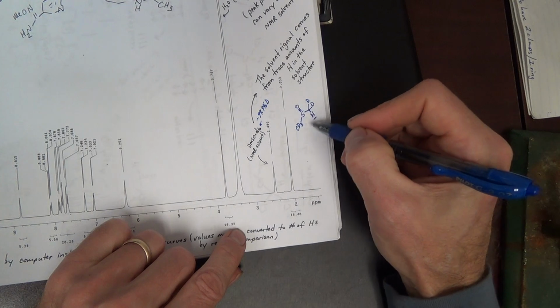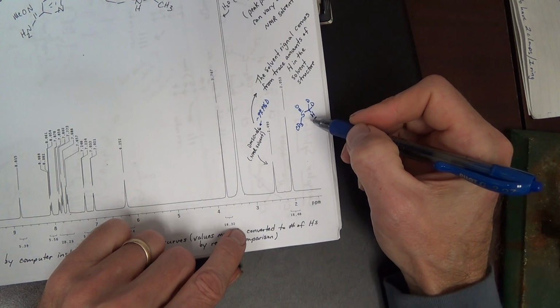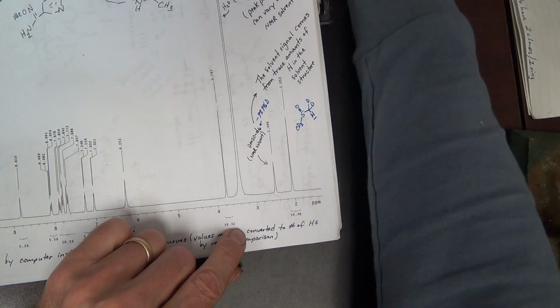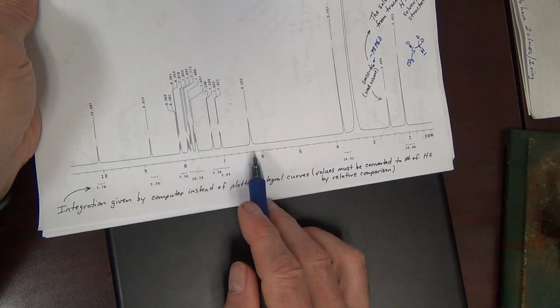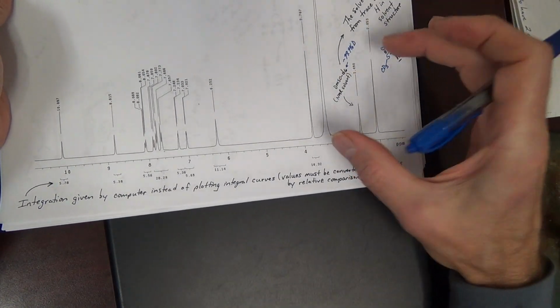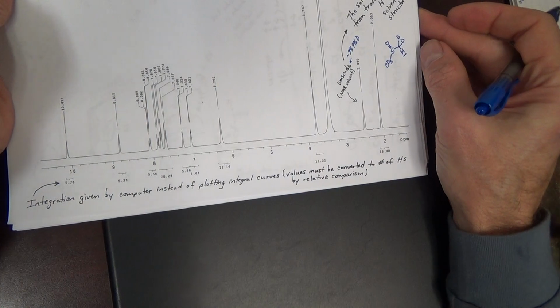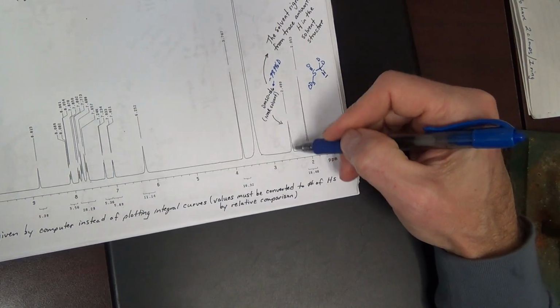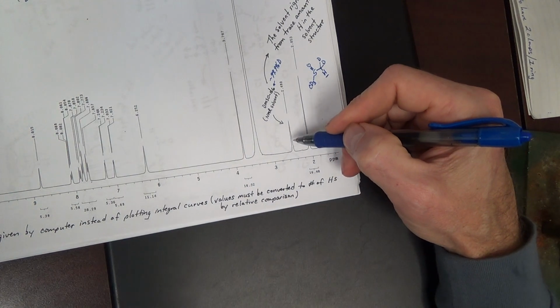Now, if this was complete hydrogen, all right, 6 hydrogens, this signal would be like a mile tall, and it would make the other signals quite small relatively. And that leads to practical problems related to noise in your spectrum. All right, but a small solvent signal is okay.